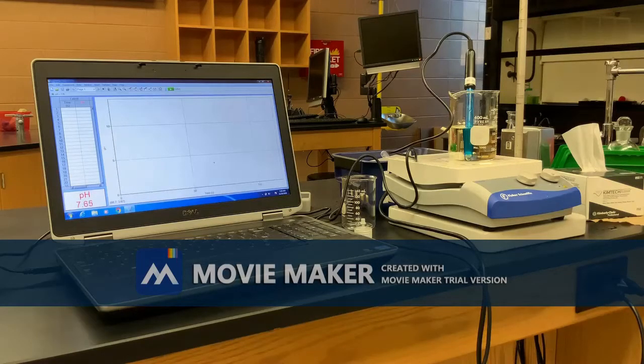I've tried quite a few pH probes, and I've even changed LabQuest Mini interface boxes to see if one of those was the issue, why our pH is not stabilizing, why it keeps jumping around. Each of the pH probes that I've tried are doing the same thing. And so it's gonna bring a little bit of difficulty in trying to pinpoint exactly what our starting pH is and exactly when we've got a nice neutral biodiesel solution, but we're going to give it our best try.